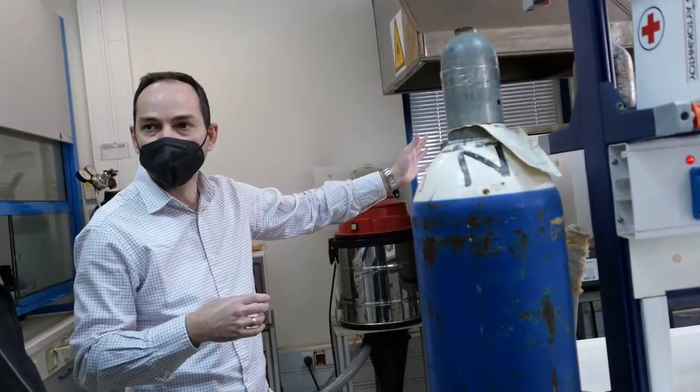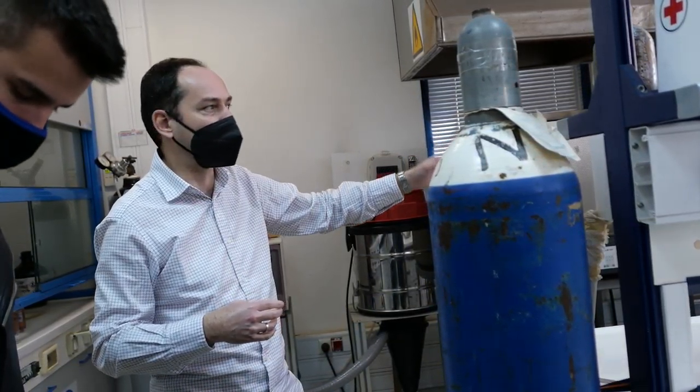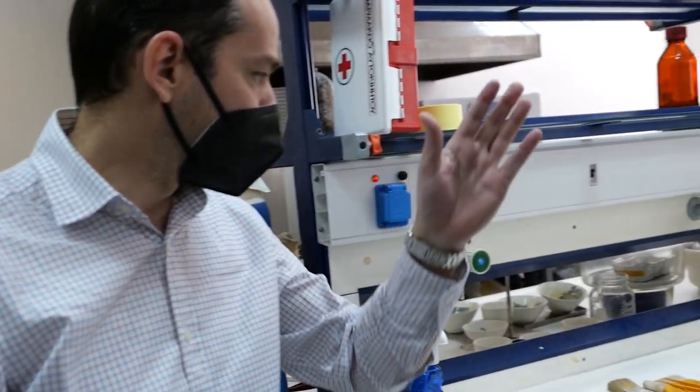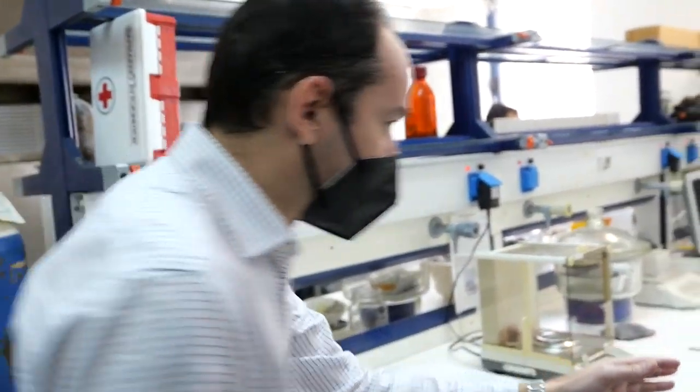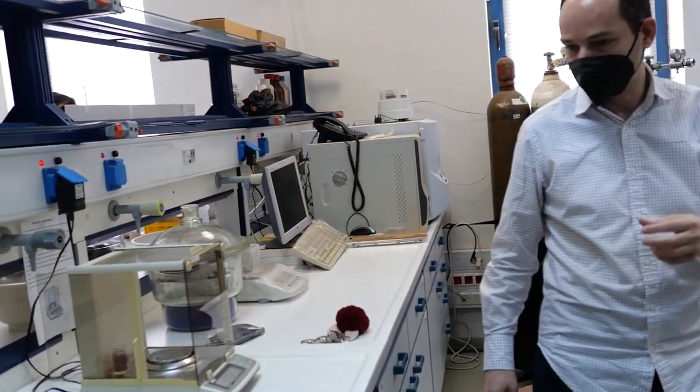We can use a furnace to measure properties like moisture, volatiles and ash. We have other instruments like this one here that measures the calorific value. For example, you can have a waste and then you need to burn the waste in order to use this as a fuel.